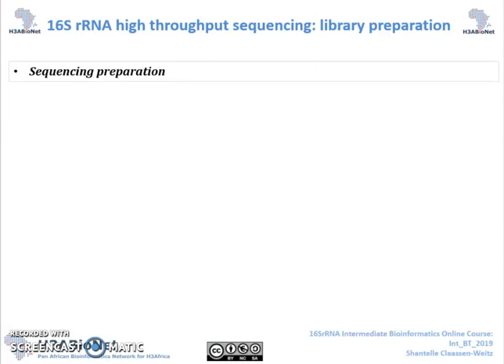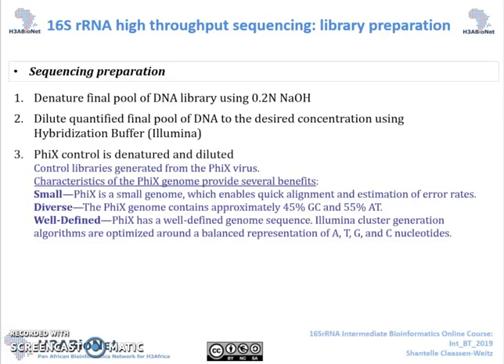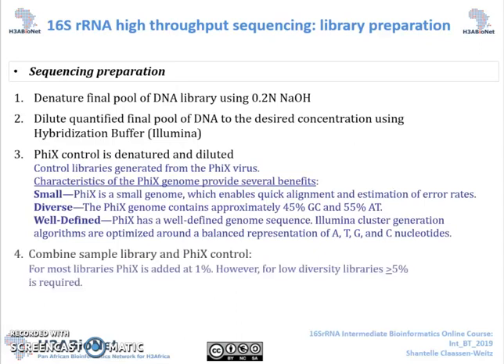Finally, we prepare for sequencing using the Illumina MiSeq v3 600-cycle cartridge. We first denature the final pool of the DNA library using sodium hydroxide. We then dilute the quantified final pool of DNA to the desired concentration using the Illumina hybridisation buffer. A PhiX control is denatured and diluted. We then combine the sample library and the PhiX control. The rule of thumb is to use a lower spike-in of PhiX for higher diversity libraries, whilst lower diversity libraries require larger spike-ins.